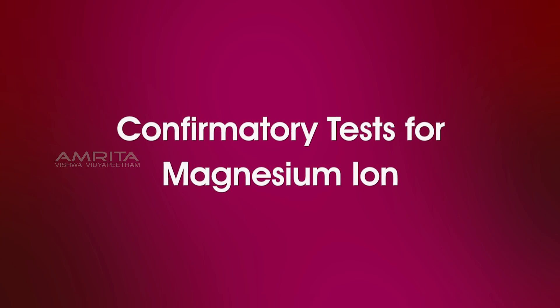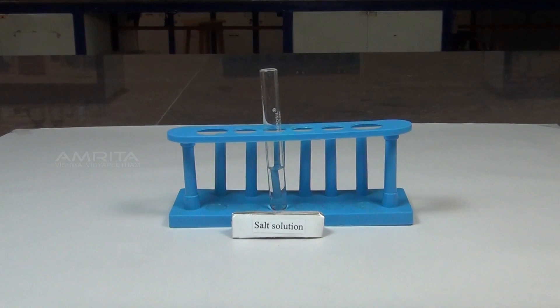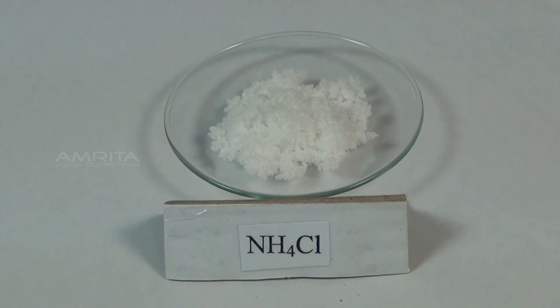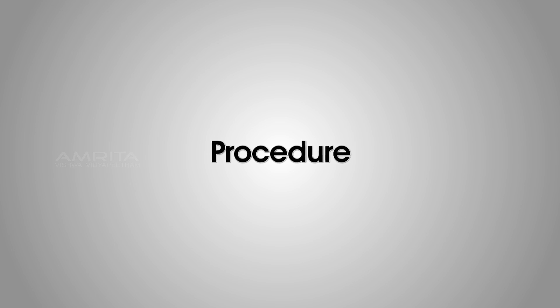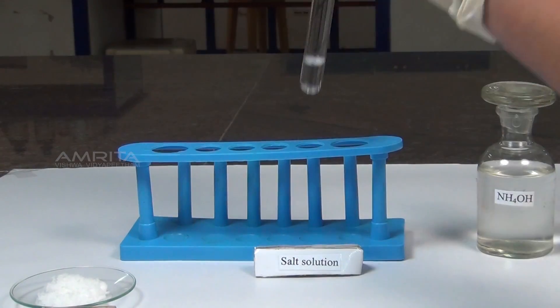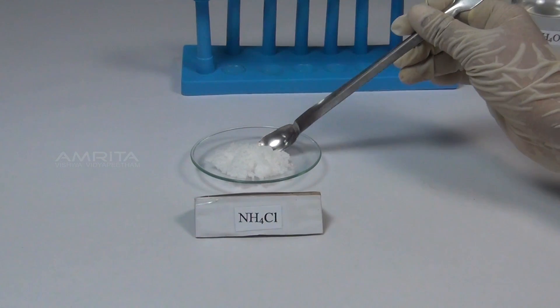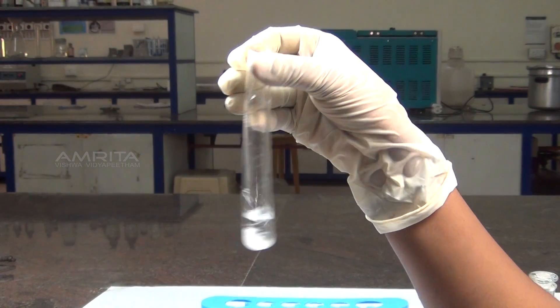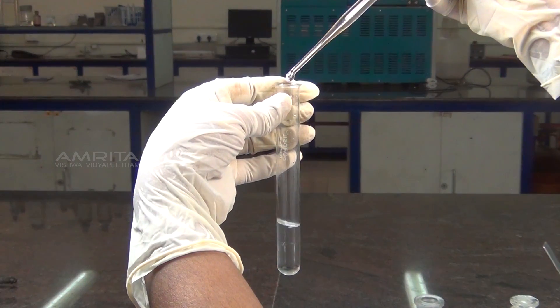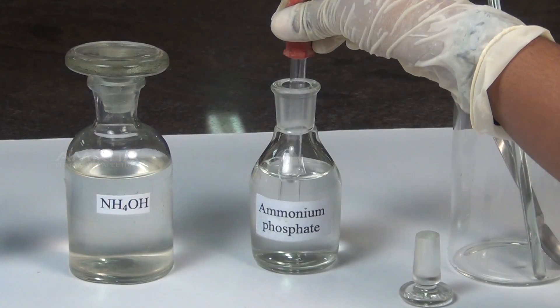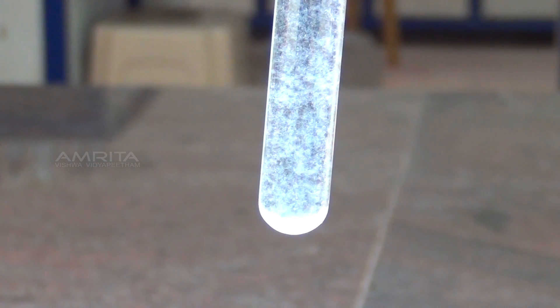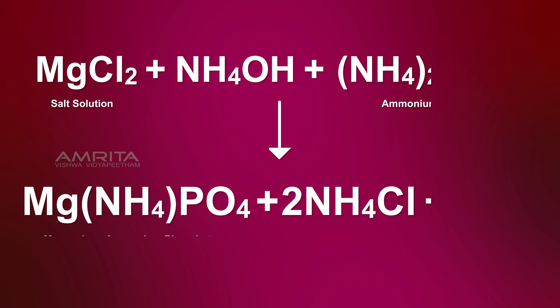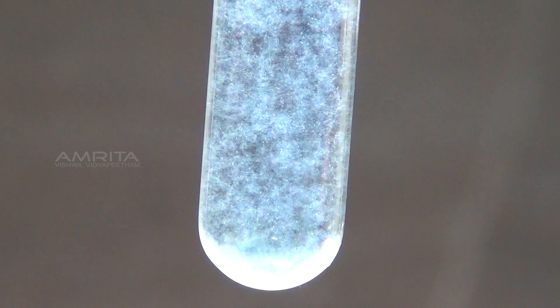Next, we look at the confirmatory tests for magnesium ion. Ammonium Phosphate Test. Materials required: salt solution in a test tube, ammonium chloride, ammonium hydroxide, spatula, dropper, and glass rod. Procedure: Take a small quantity of salt solution in a test tube. Add a small quantity of ammonium chloride using a spatula. Shake the test tube well. Using a dropper, add a small quantity of ammonium hydroxide. Then add a small quantity of ammonium phosphate solution. Scratch the inner sides of the test tube using the glass rod. A white precipitate of magnesium ammonium phosphate is formed due to the reaction of magnesium ions with ammonium phosphate.